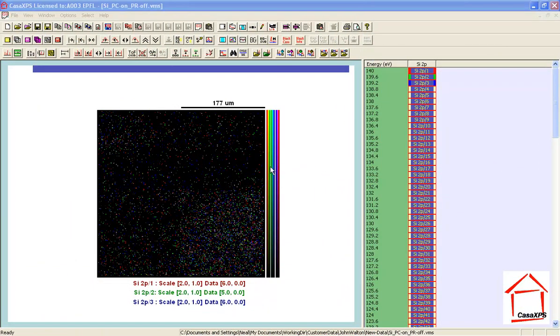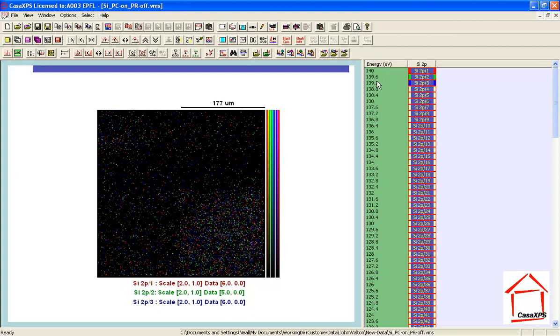In this video I would like to illustrate how spectra respond to the composition of the sample, where the sample is a material with an oxide film. Here we have a silicon wafer with an oxide layer on the surface, engineered so that there are different thicknesses of oxide at different positions. By imaging the sample we can identify where the different film thicknesses are, and by measuring a stack of images we can retrospectively create spectra from different zones. Each image in the stack has been measured at a different energy with a uniform step size, giving effectively a spectrum at each pixel.